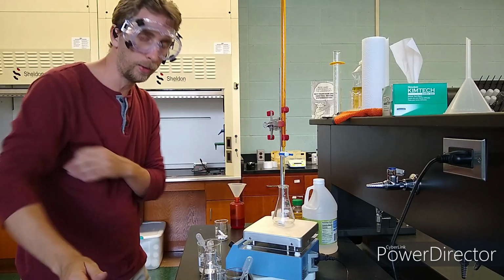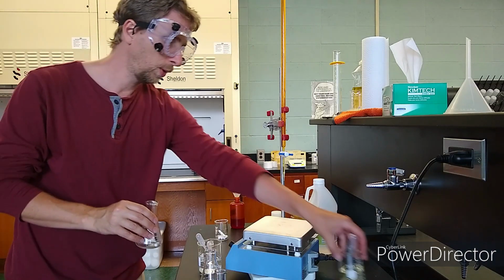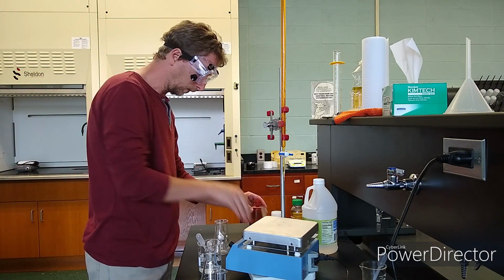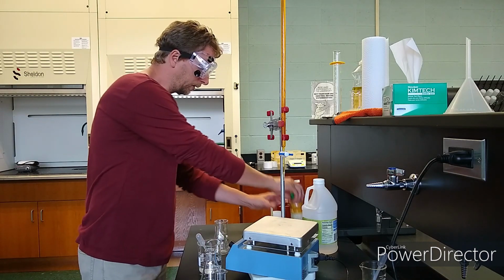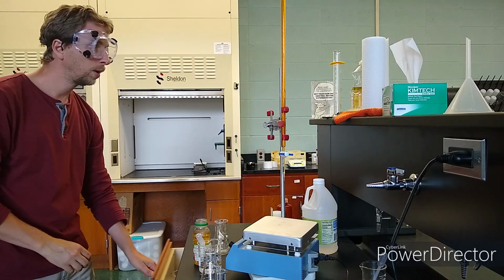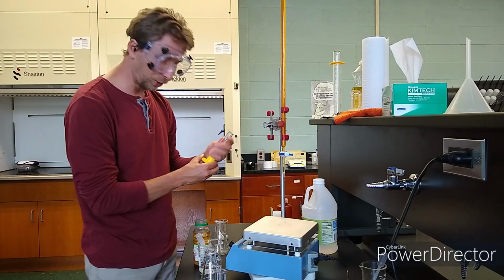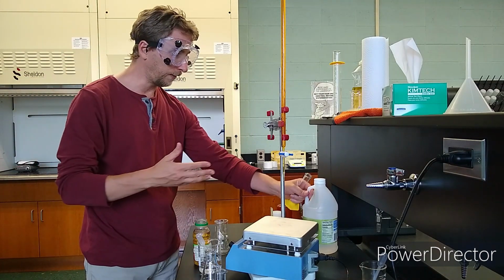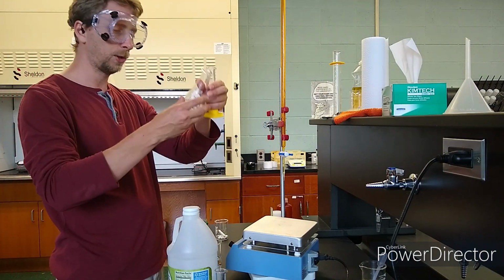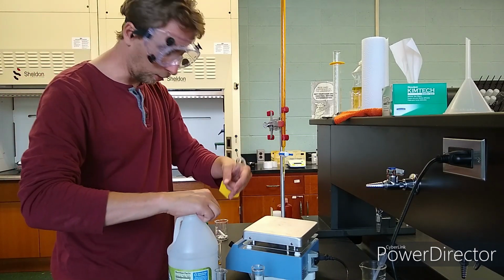Next I'm going to prepare the juice solution, and that's pretty easy to do. All that we need is 20 milliliters of juice. That's what the directions say. Okay. Looks like I'll be using this one. All right, 20 milliliters of juice. Remember, the vinegar though is intended to preserve the ascorbic acid, so I'm going to go ahead and put the vinegar in here first to help to knock out any contaminants that are in there to preserve the ascorbic acid in the juice.